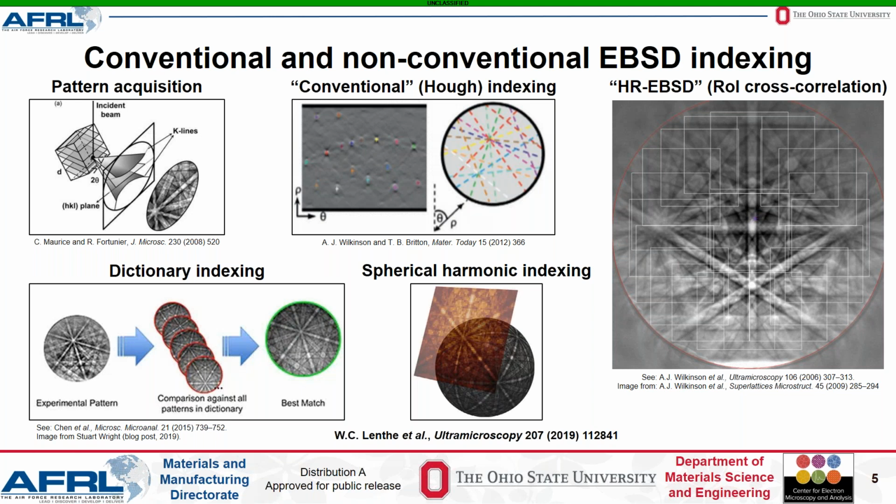While this initial result is generally rather imprecise, on the order of 0.7 degrees, it displays incredible robustness against noise and low pattern resolution, being capable of indexing raw patterns with no humanly identifiable features whatsoever. The orientation precision can also be significantly improved by a second stage refinement operation following initial indexing. However, the brute force comparison is quite slow without throwing a massive amount of computing hardware at the problem.